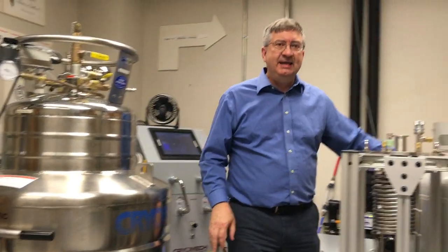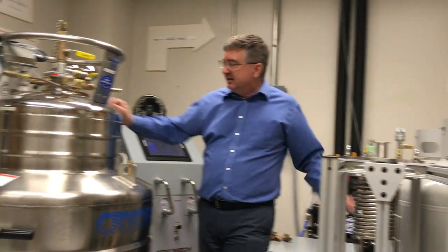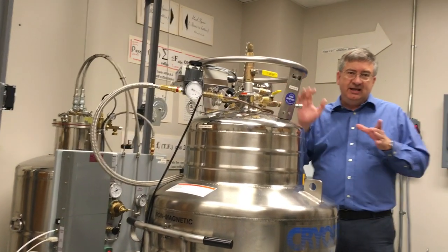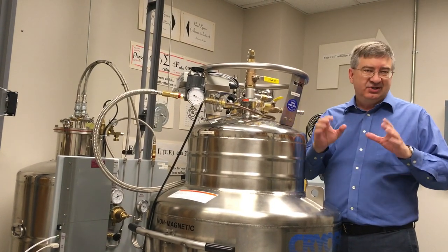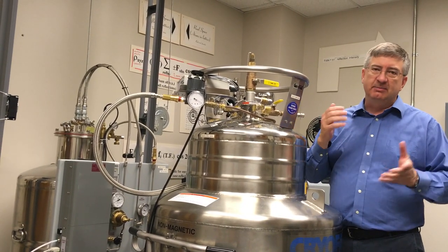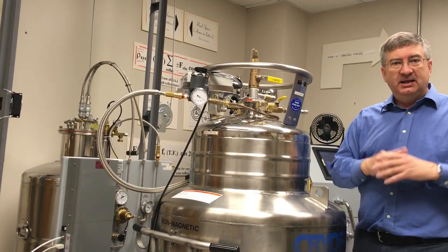We take the 300 psi helium — still a gas — and bring it over here into this helium purifier, where the helium is cooled to liquid nitrogen temperatures, still a gas, and that's designed to get rid of all the impurities: nitrogen, oxygen, carbon dioxide, water, whatever might have snuck into the system. Get rid of it.